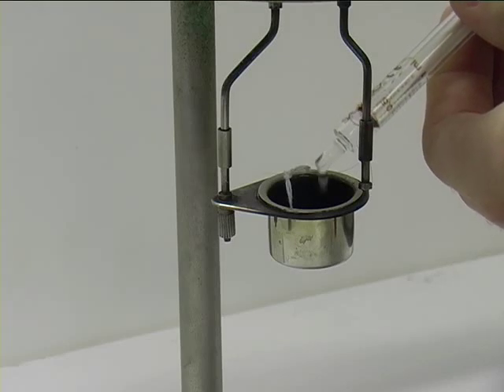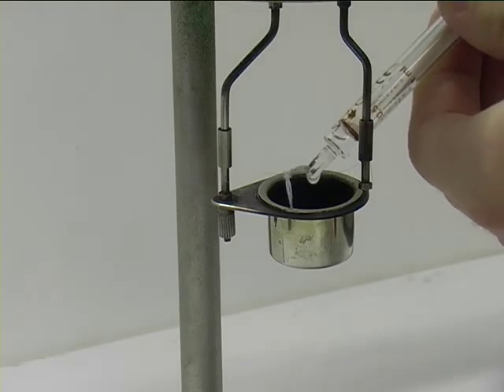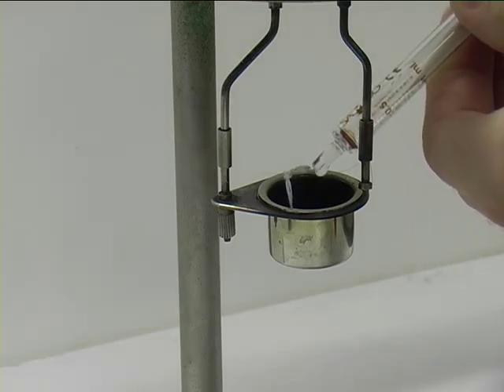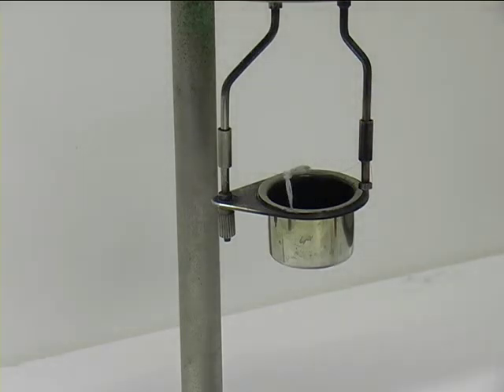When run, a high current is passed through the sidearms. This will cause the fuse wire to burn through igniting the cotton and the cotton leading into the crucible will ignite the sample.